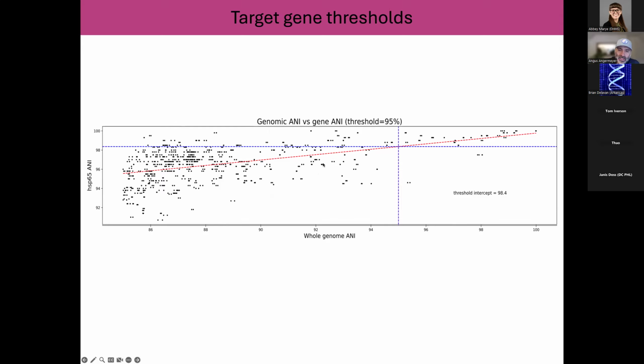So this is kind of on the back burner, except that I'm just using the lowest pairwise comparisons that I see as setting the threshold. So the threshold for HSP65, I'm usually setting at about 94% to capture these lowest two. So it ended up being a little bit less sophisticated of an approach than I had hoped. And it's going to vary depending on the pairwise comparisons of the database. So this is all based on my earlier RefSeq database of 217. But now that it's closer to 240, I'm going to have to redo this and recalculate what those thresholds would probably be.